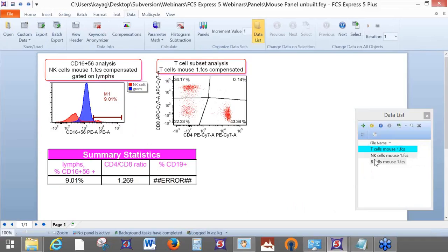And that's a really key point. So when you are making a panel, what you want to do is just build the layout normally as you would. So there's nothing special you have to do really to use the panels feature when you're initially building your layout. So let's continue building this.